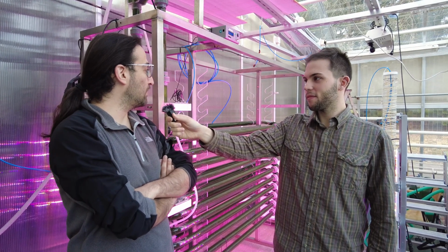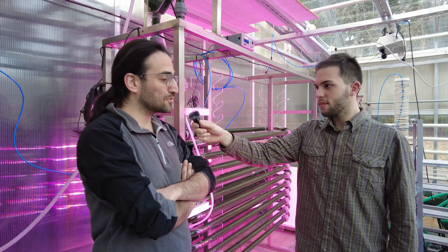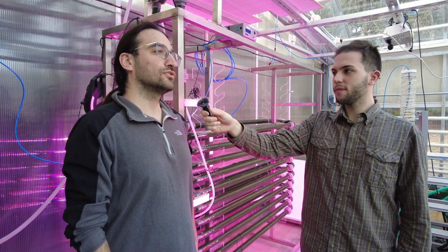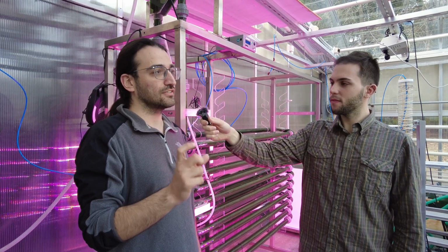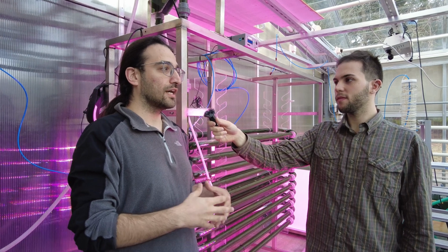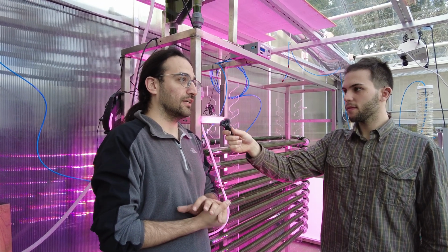I've been working and living in Turku since November 2022. And I'm working here with the photosynthetic microbes group, as you said. The photosynthetic microbes group is a fundamental and applied photosynthesis lab. So in our lab, we are investigating how simple photosynthetic organisms like microalgae and cyanobacteria are photosynthesizing, how they are harnessing energy from the sun, and how we can utilize this energy to produce algae biomass or the metabolites or products that we can extract and use in different sectors. So these are the questions in our lab.